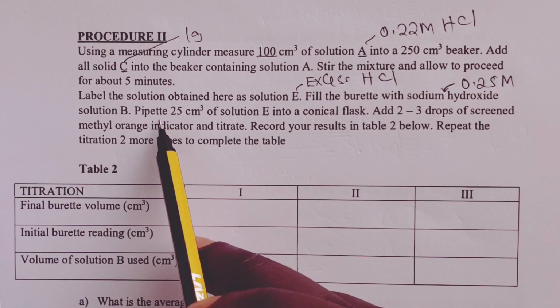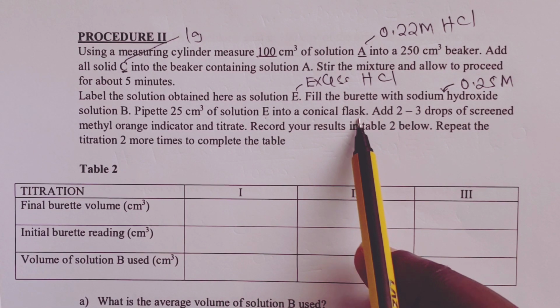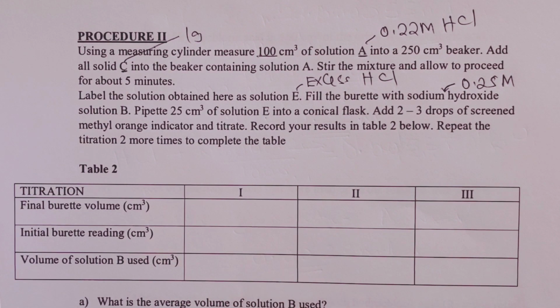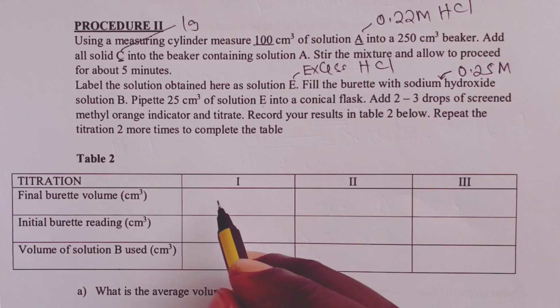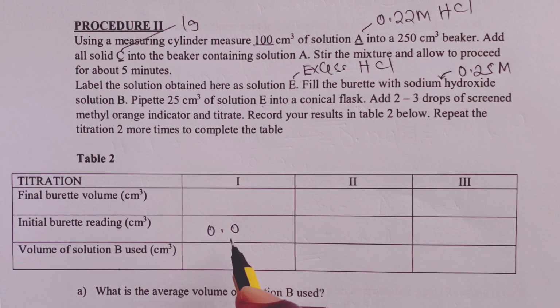We then pipette 25 of E into a conical flask, add 2 to 3 drops of screened methyl orange indicator and titrate. At the end of the day, we are supposed to fill table 2. So again, let's assume a candidate got 0.0 as the initial burette reading.